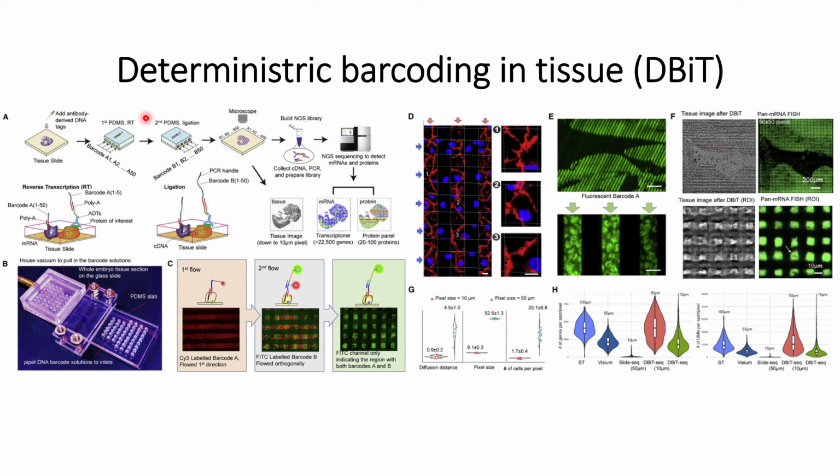They also did another experiment where they used these antibody tags to detect the protein of interest, and they have used microchannel plates of different sizes. In the first case, whenever the oligo DNA tags detect the mRNA, it will trigger reverse transcription, and that will lead to cDNA strands within those cells. The poly A tails will also be present along with the mRNA.